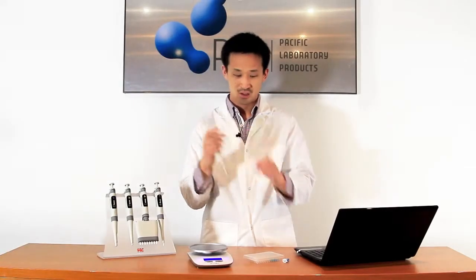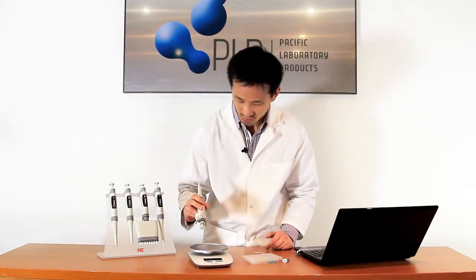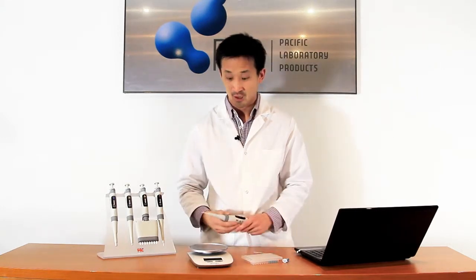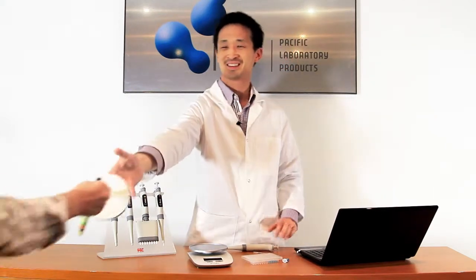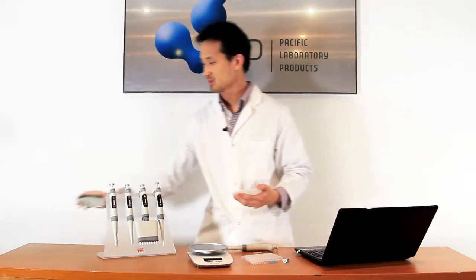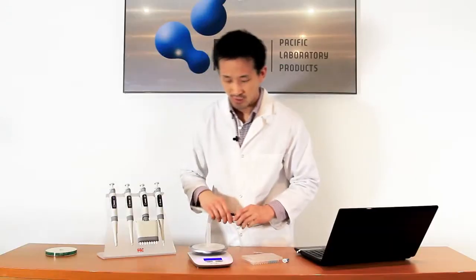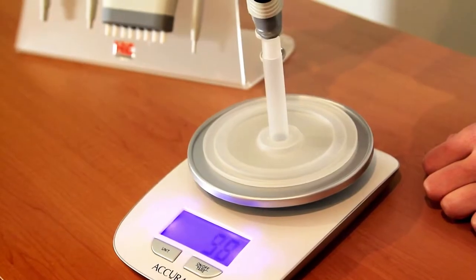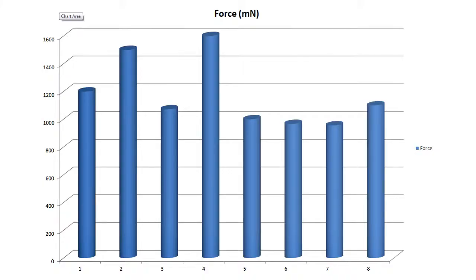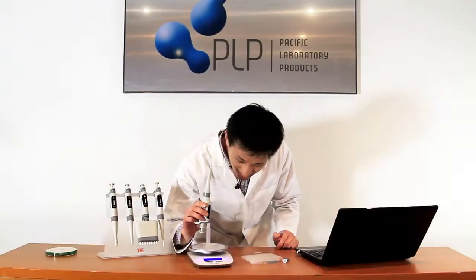Even the tip ejection force is really quite light as well. Repeating the test with a tip on a 20 microlitre pipette, we got between 950 and 1400 millinewtons of force required for ejection. Quite impressive really.